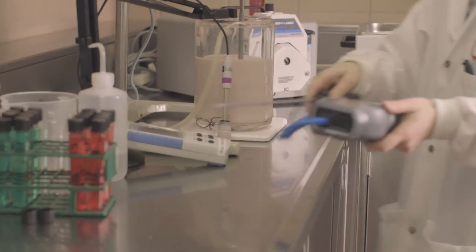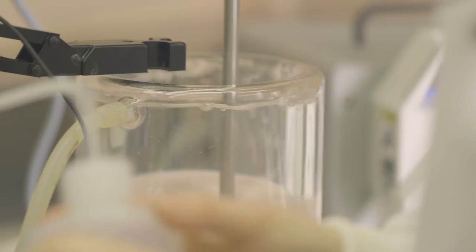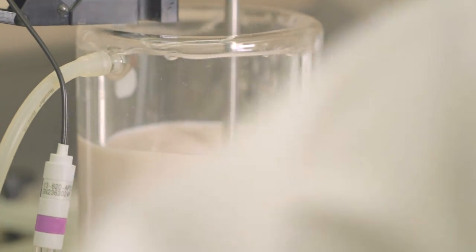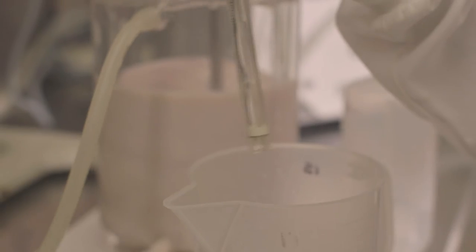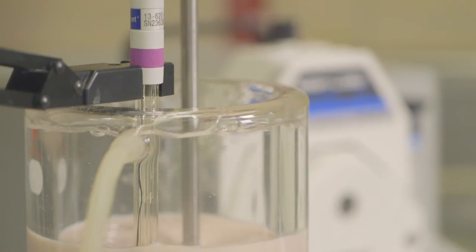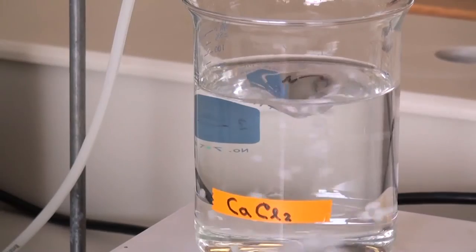Let's take the yogurt production industry. If the industry decides to add new bacteria streams to its recipes, the first question to ask is, what will be the concentration of bacteria? What will be the proportion of each bacterium? In what matrix do we want them? Do we want them in spoonable yogurt, such as Greek yogurt, or in lighter yogurt, such as drinkable yogurt? This makes a lot of conditions to test.